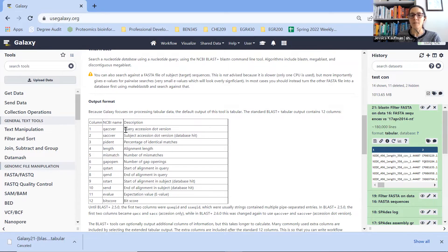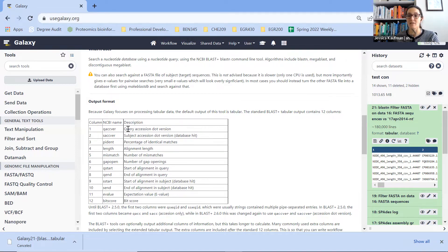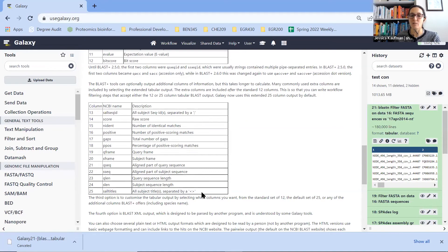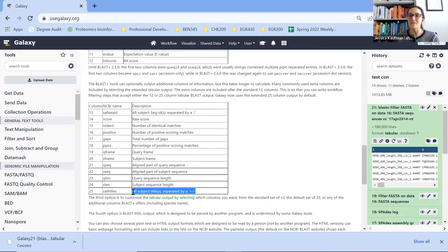So what do we really care about? We care about query accession number, subject, and percent identity. The query is which of the FASTA files from our SPAdes assembly was the best match. The subject is what in the database was the best match, and percent identity is how similar they were. We also care about the final column — we did the expanded set of columns to get more information, including all subject titles, because knowing the accession number of the subject isn't as helpful as actually knowing the name of the species.